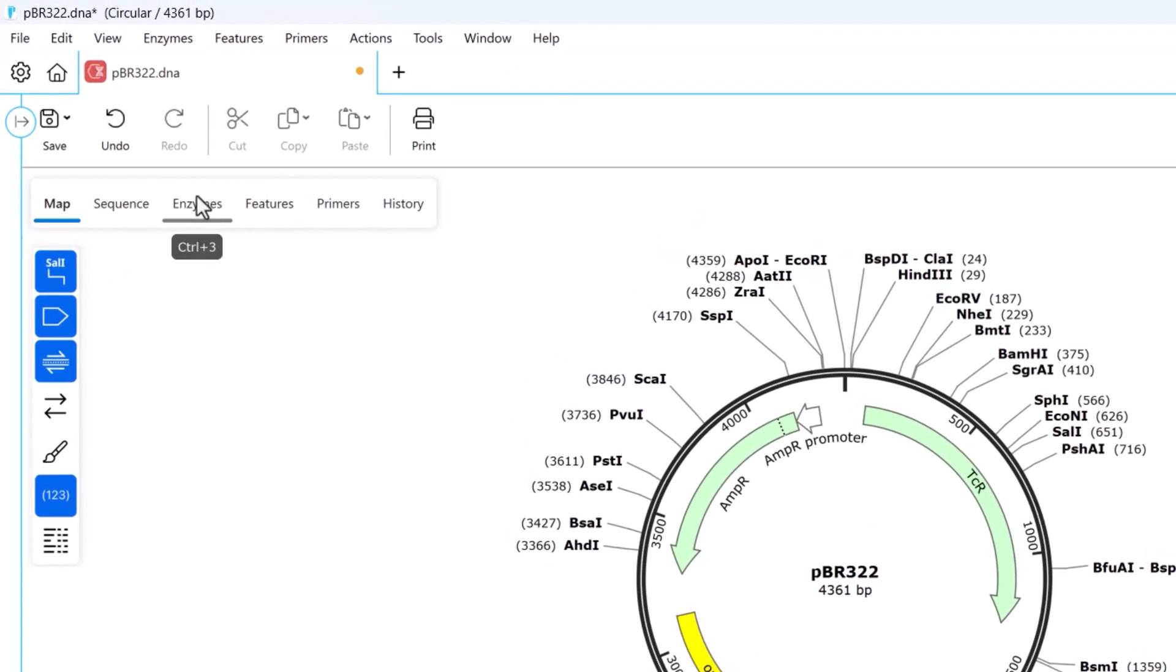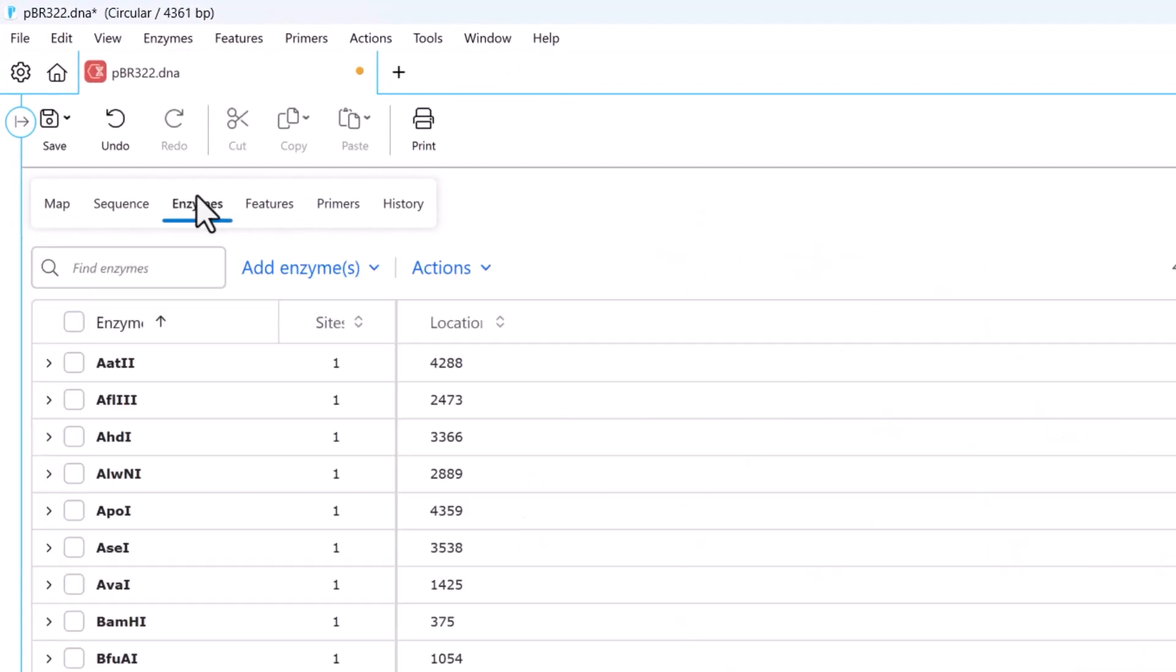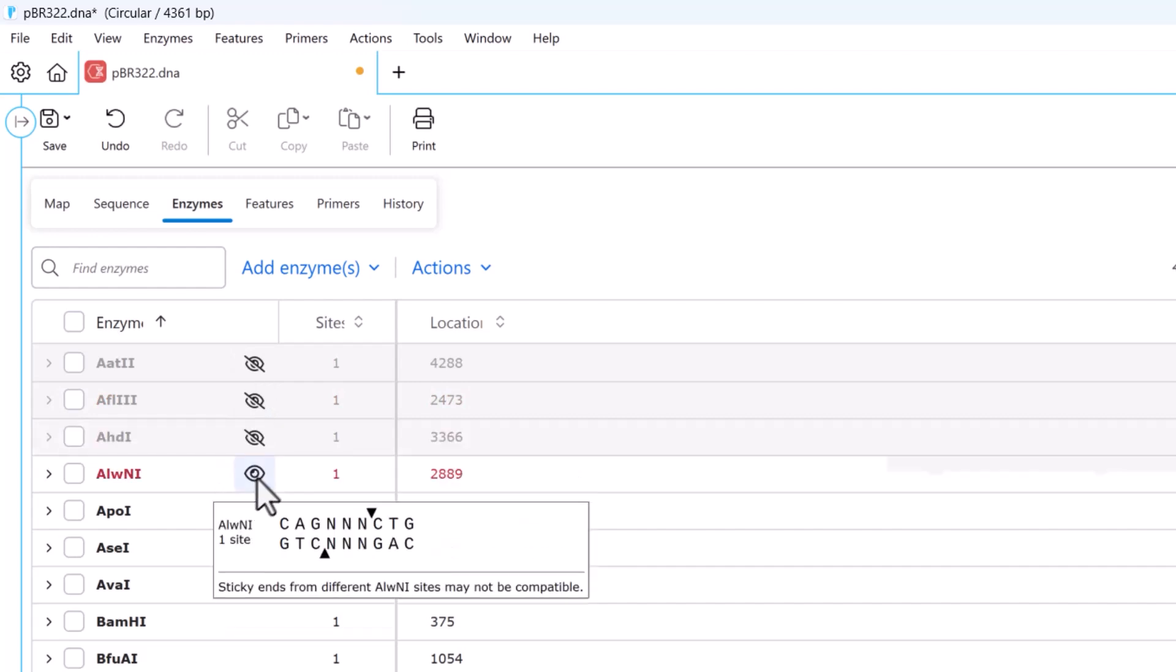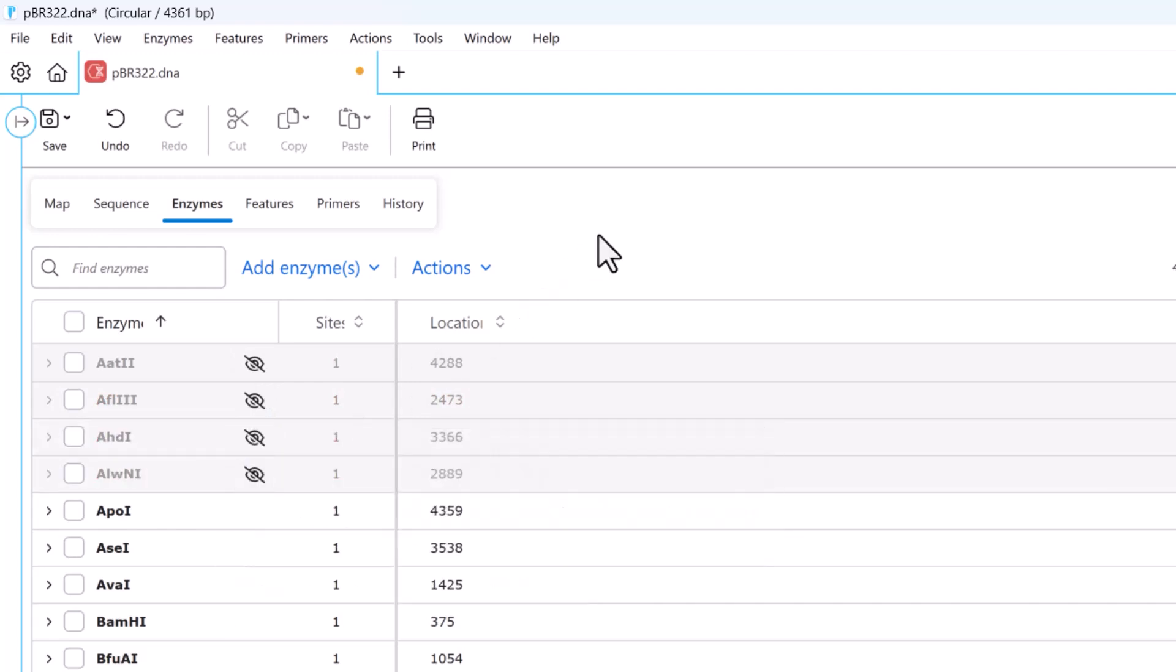Here you can easily find and add enzymes and view different enzyme sets. You can also hide enzymes or remove them from your chosen enzymes.